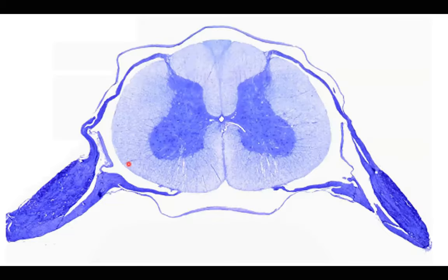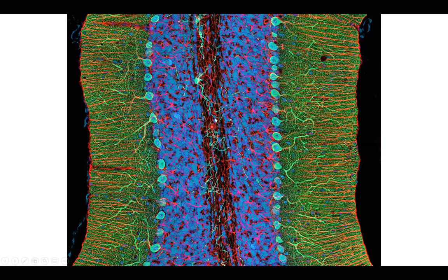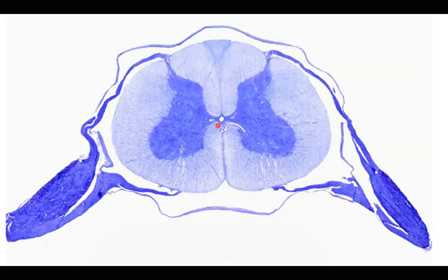Our next slide involves the spinal cord. As part of the central nervous system, it has gray matter and white matter — but notice the orientation is different. In the brain — both the cerebrum and cerebellum — gray matter is on the outside and white matter is inside. It's the opposite in the spinal cord: white matter is superficial and gray matter is deep.